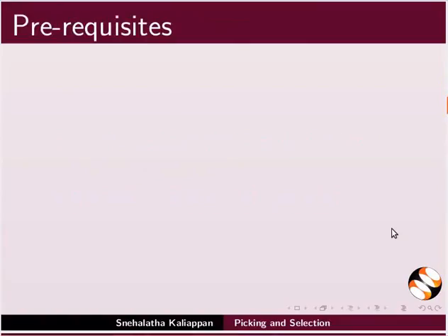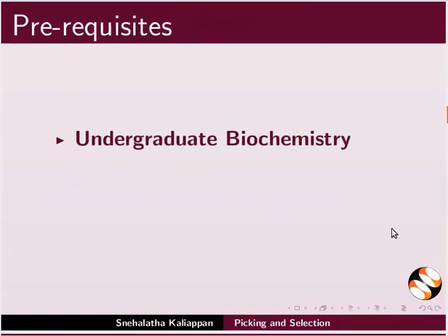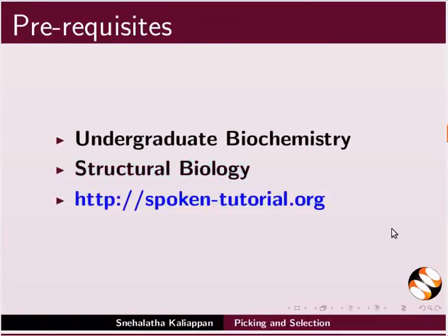To follow this tutorial, you should have knowledge of undergraduate biochemistry or be familiar with structural biology. For relevant tutorials, please visit our website.